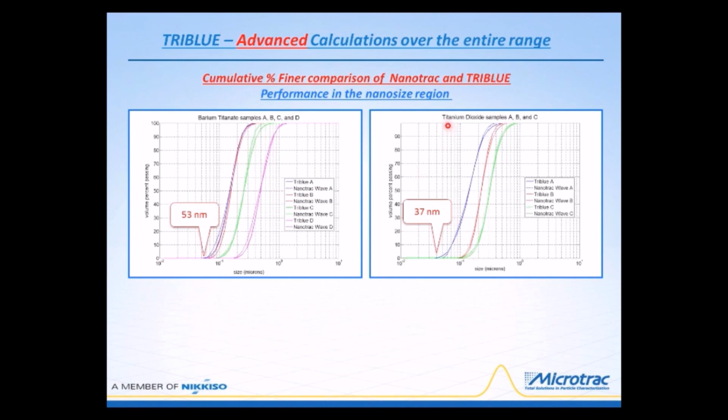Over here on the right-hand side, we have titanium dioxide, and this is the big component that provides for white paint. Other colors and pigments are typically added to a titanium dioxide suspension in the paint can to achieve the colors that are desired. We have 3 samples of titanium dioxide here.